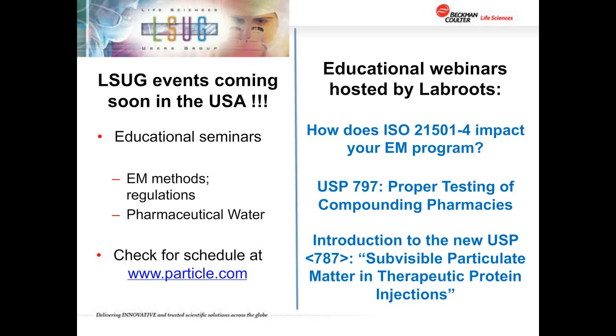Certainly, it's something that's evaluated in the design and the manufacture of an instrument and tested, but generally it will not be changing in an instrument over time, because it's fundamentally based on the physical space of the detection area in the sensor, and that really will not change radically. If it might happen to, there's other aspects of the calibration method that will pick up some radical disturbance of that area. So generally in the field, that particular function is not tested.